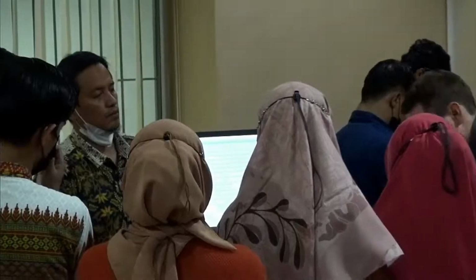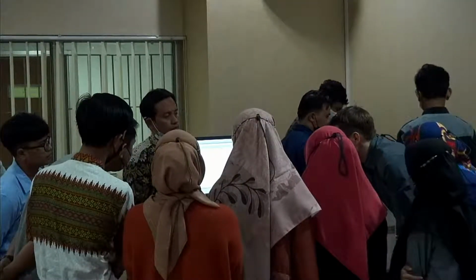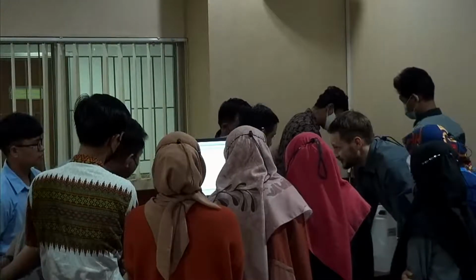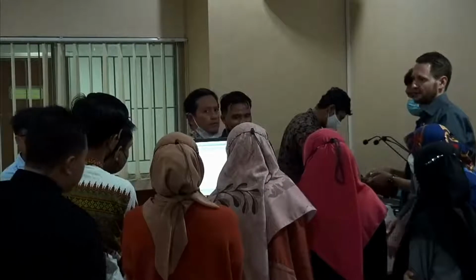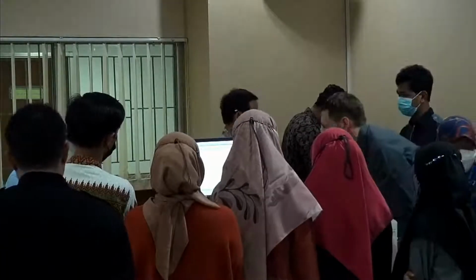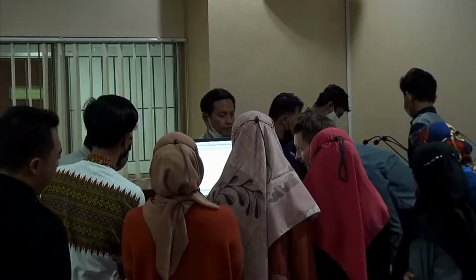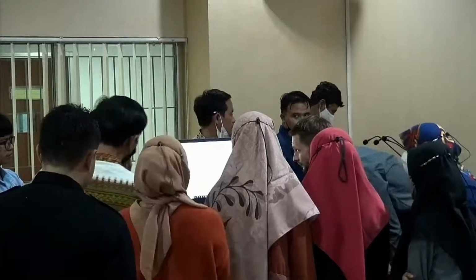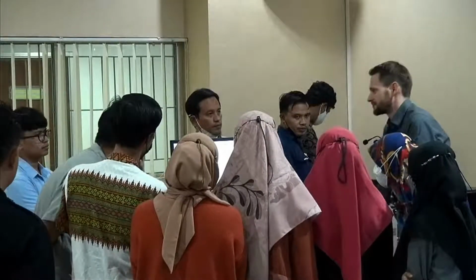Good thing is for such common materials, this is the one that starts with alumina, as you can see, so it's a very big database. Of course, you will always find material which is not in there. So in our case, I just look for aluminium oxide, corundum, for example. Yeah, there it is. I double click, and now I have automatically filled these parameters.